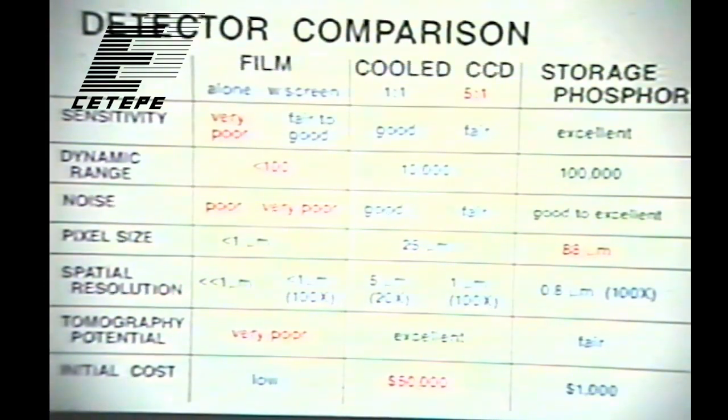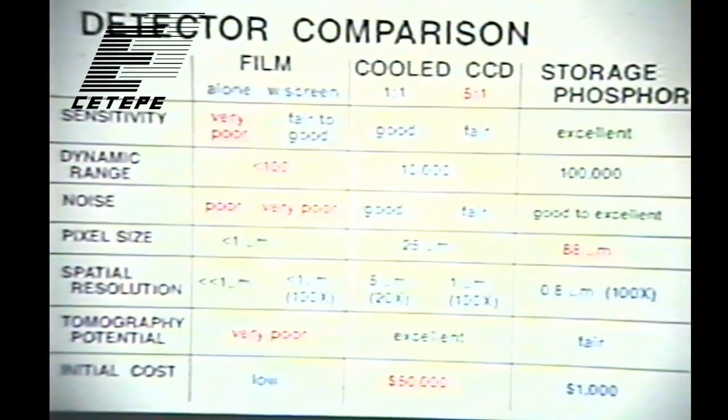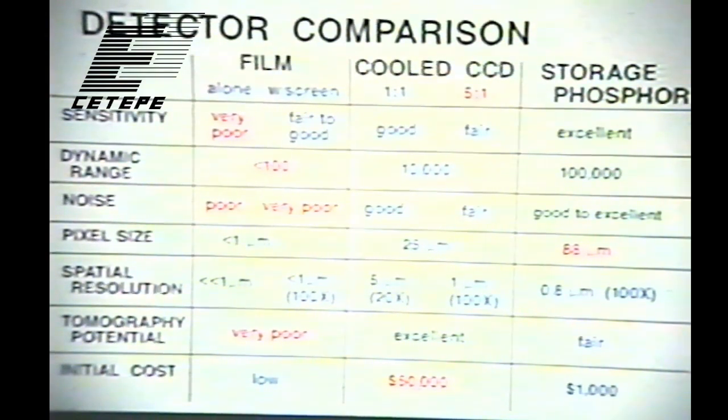This, as opposed to a consumer camera, this kind of price range is for what's called a scientific cooled slow scan CCD. And what's different about them is basically the dynamic range or the noise level. In a consumer device, the noise level will be 300 to several thousand electrons per pixel per readout.